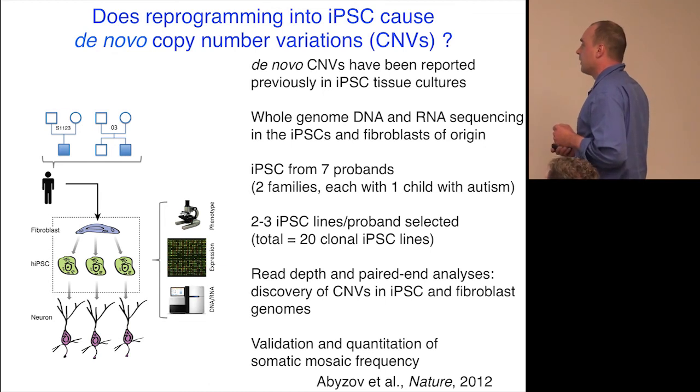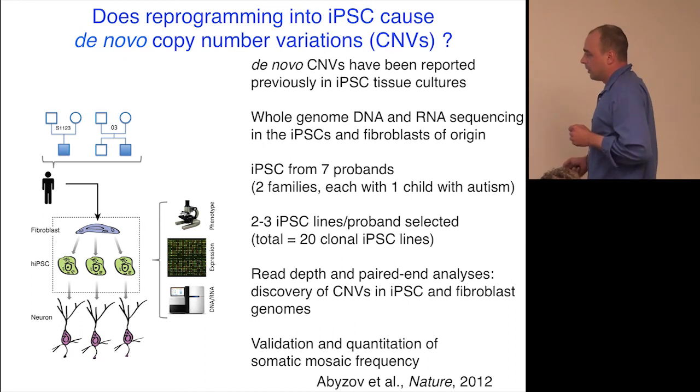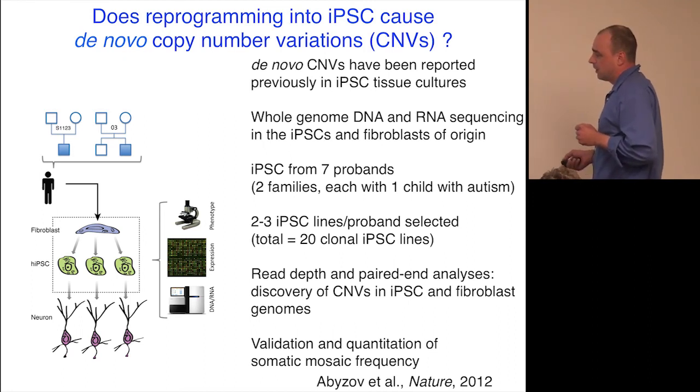Then we did read depth and paired end analysis for the discovery of CNVs in both the iPS and the fibroblast genomes. And this work was all published recently, in December last year, in Abyzov et al.